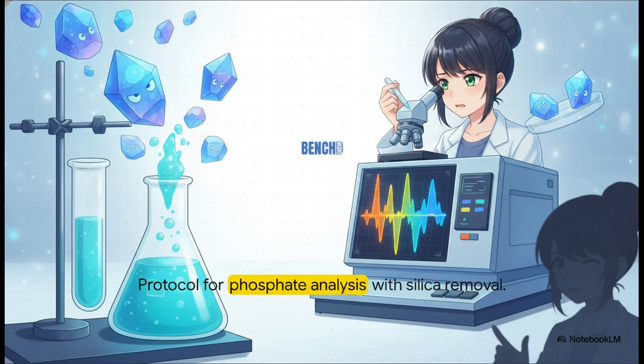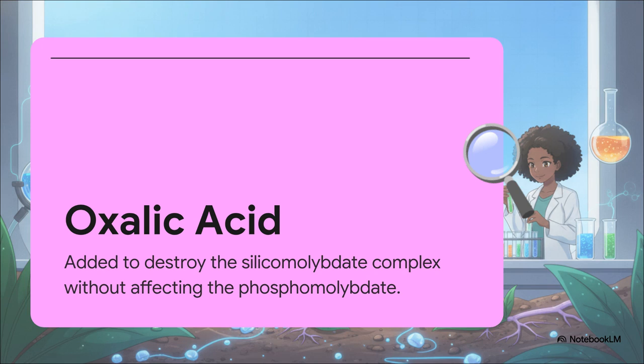To the naked eye, and crucially, to our highly sensitive analytical balances, the extra weight from the silica looks exactly like the phosphate. This causes unexpectedly high false readings that can completely trick the analyst and totally compromise the integrity of the data. So you might be wondering, how do we defeat this interference?